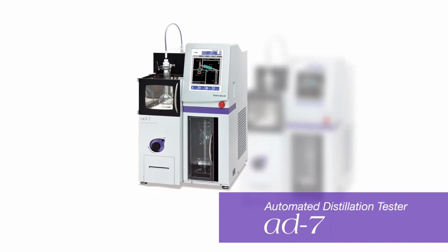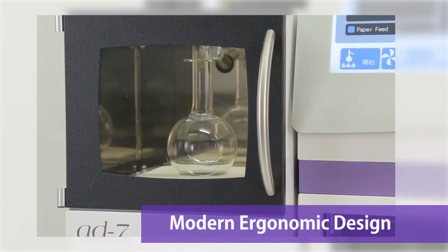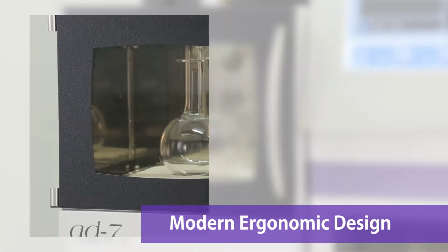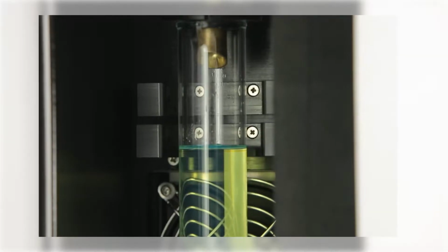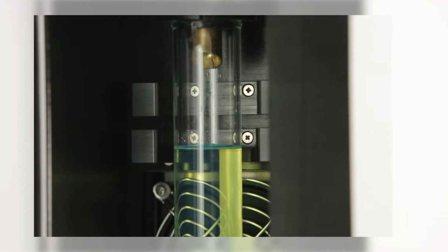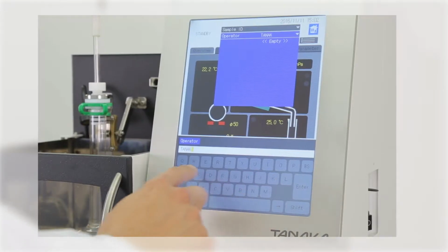Distillation is a very traditional method for separating the various boiling fractions of petroleum liquids, dating back to the early 1900s, initially involving numerous cumbersome glass apparatus that required manual handling and adjustment. Distillation is still a very important test performed on distillate fuels and gasoline. It is run in heavy volumes in most petroleum labs around the world, as it gives essential information on the composition of petroleum products and fuels.